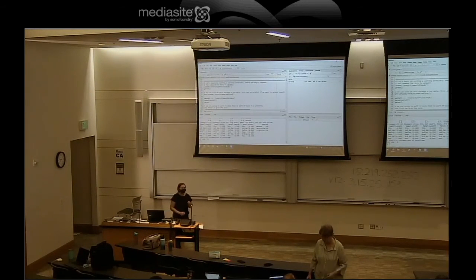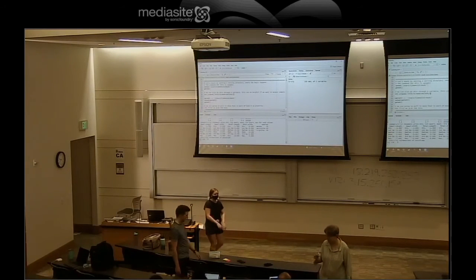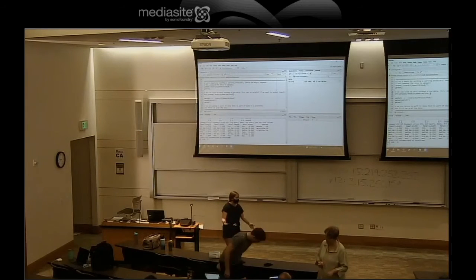So your working directory needs to exist. To make yourself a working directory, you can either create that like you normally would on your computer, which is a folder, or you can use the command that I just typed out.